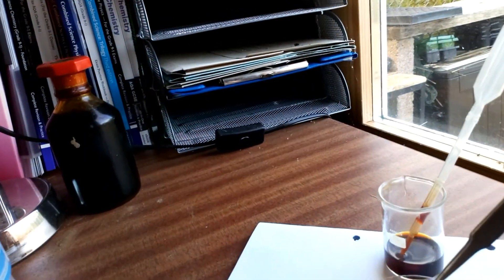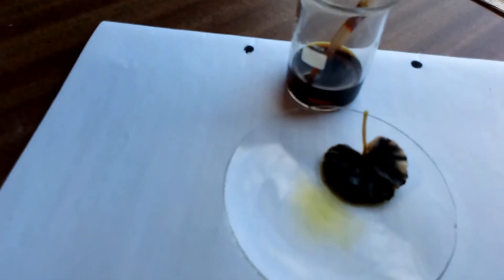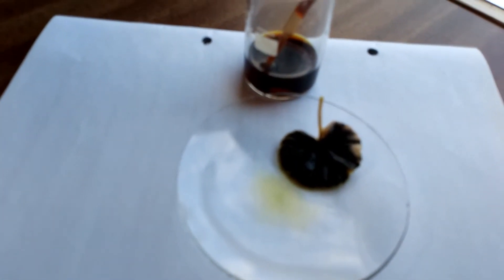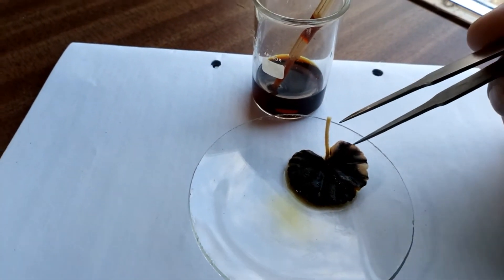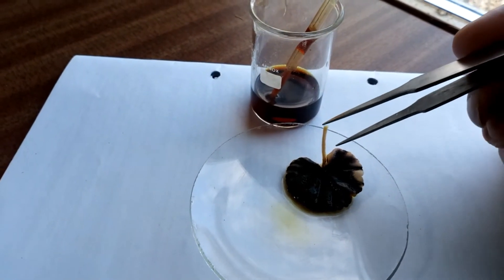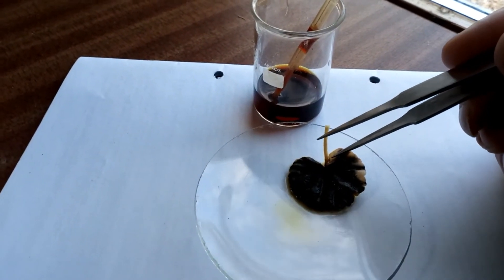So there we have tested a leaf for starch and found that that leaf contains starch, except for these small areas here and just round here.